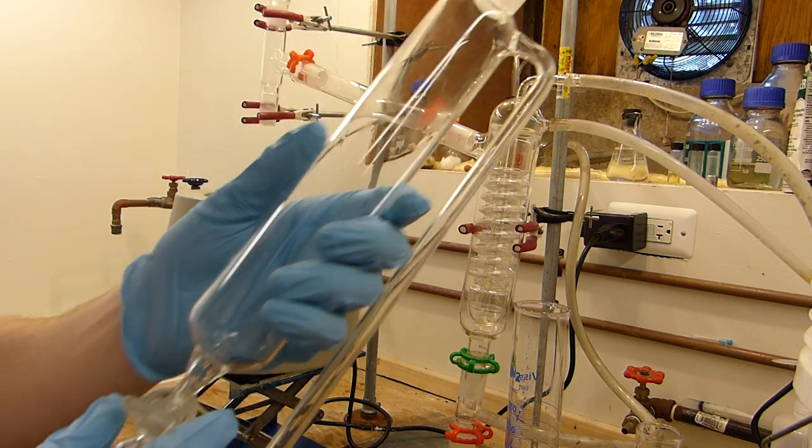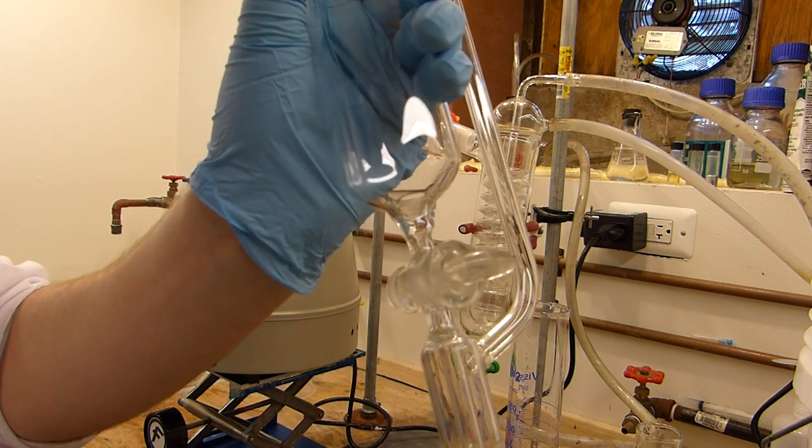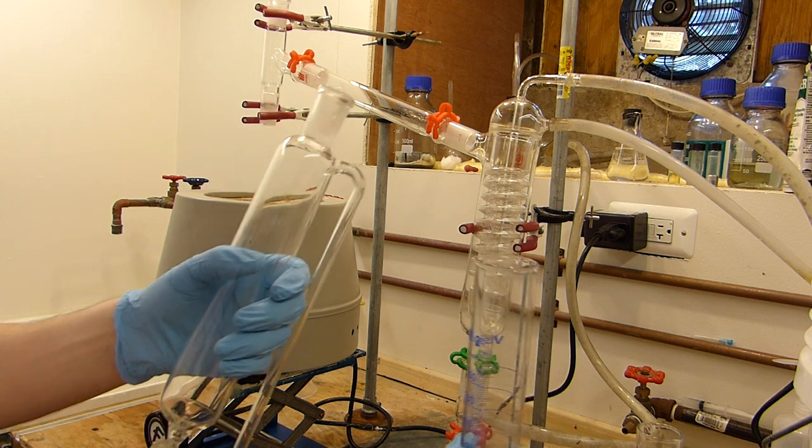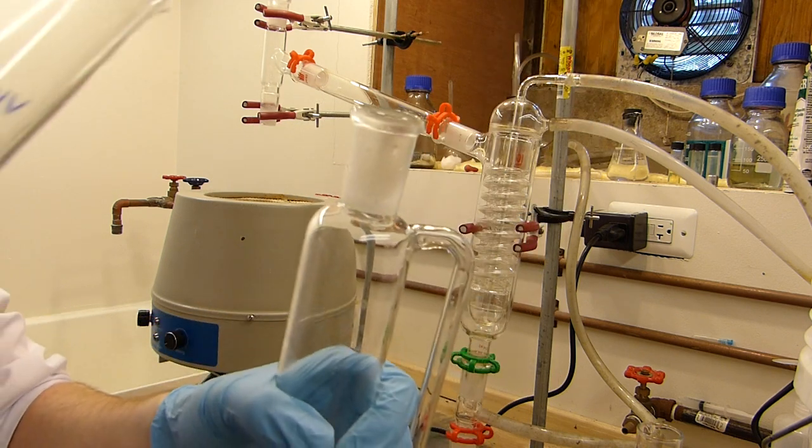In the meantime, first ensuring that the stop cock is closed, we can load 114 milliliters of 29% hydrogen peroxide into the addition funnel.